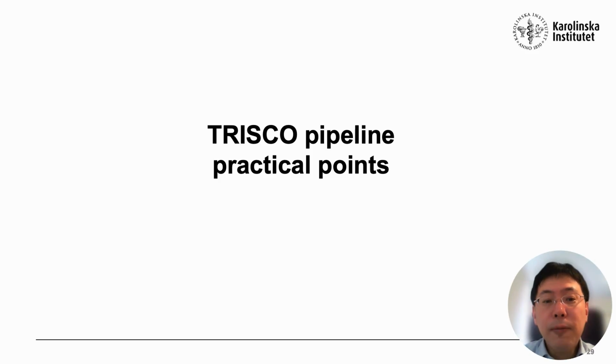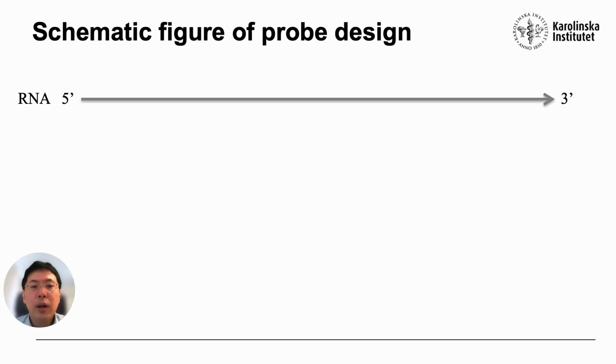Alright, in this final section, I'll walk you through the TRISCO protocol in detail and share some practical tips for successful implementation. One of the most frequently discussed topics at the beginning is probe design. Let me first show you the general strategy for probe design.